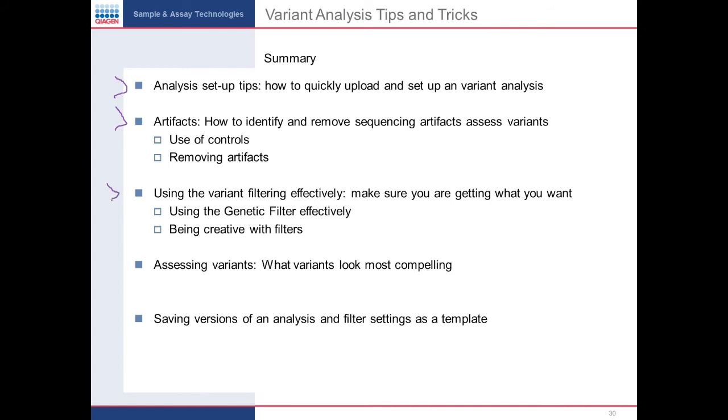How to use the filters effectively, particularly the genetic analysis filter and predicted deleterious filter. You saw me throughout be creative, I hope, kind of use things in different ways, stick things at the end sometimes. We talked about how to assess variance and kind of build up a profile, like which ones look most important, and then of course how to save versions and filter settings. So thank you very much for all attending today.